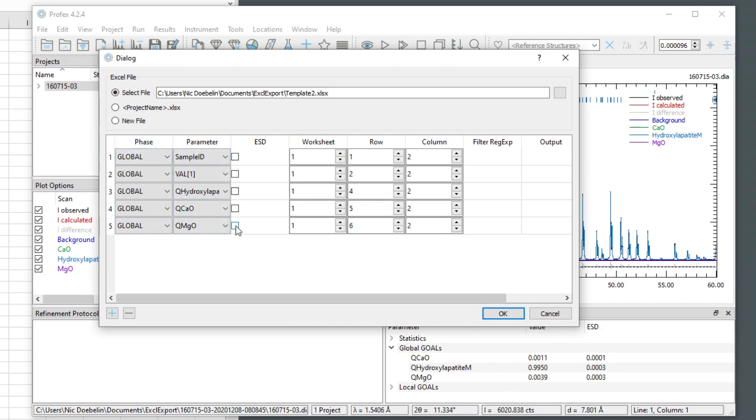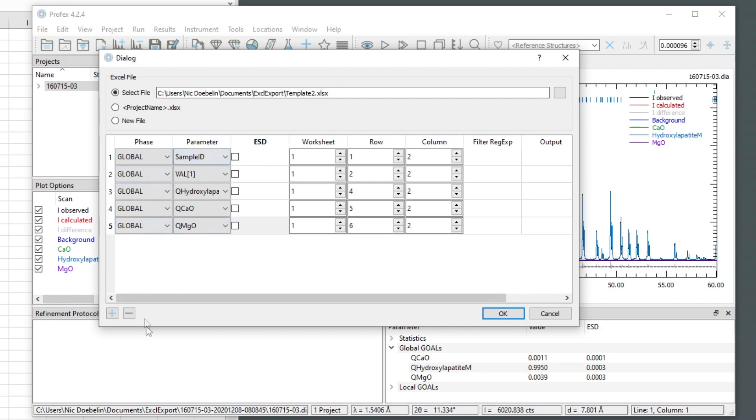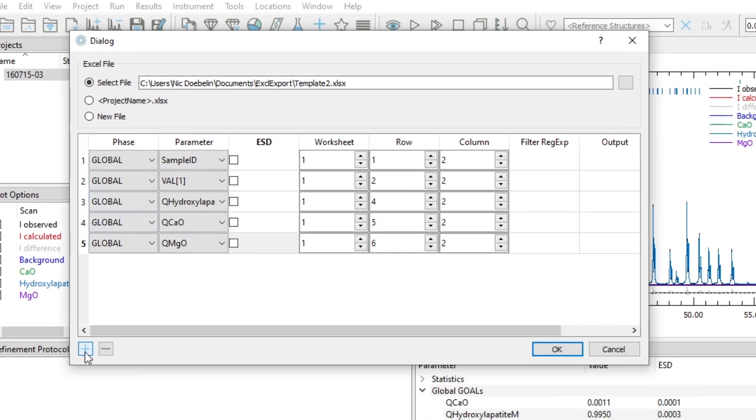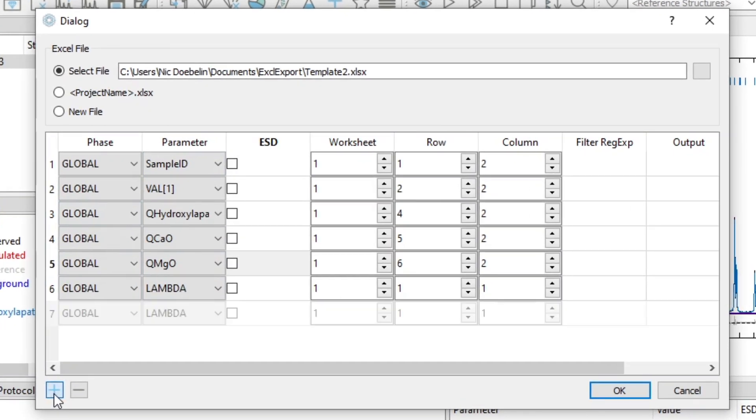So if I check, for example, for the magnesium oxide, if I check this box, it will not write the value 0.0039 to this cell, but its ESD 0.0003. So if I want to have ESDs in the next column, in column C, I would have to add three more lines.